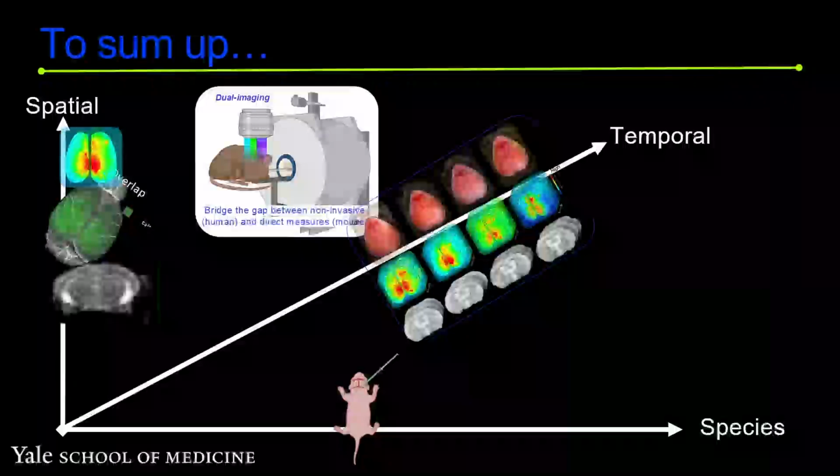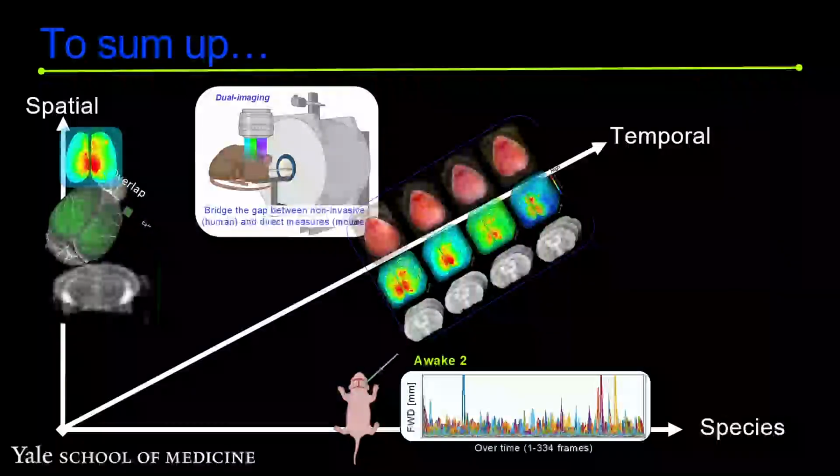And because we use the transverse sinus injection method to inject the fluorophore, these viruses are commonly available and can be bought on regular websites. So that means they can be adapted to other species as well. So from mice, we can go up to rats or monkeys even, and this way higher order mammals. And finally, by imaging the animals while awake, we can definitely bridge the gap of the anesthesia. Then, of course, we can discuss more about the implications of awake imaging in the animals.